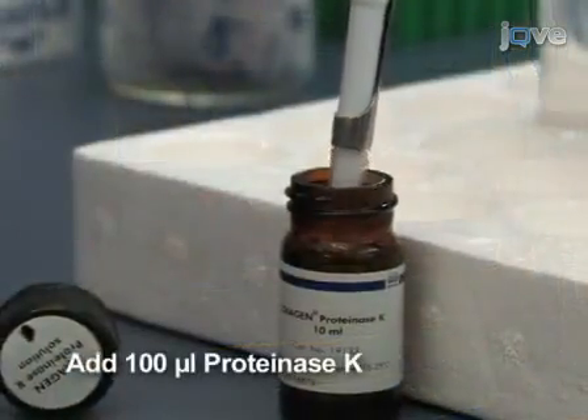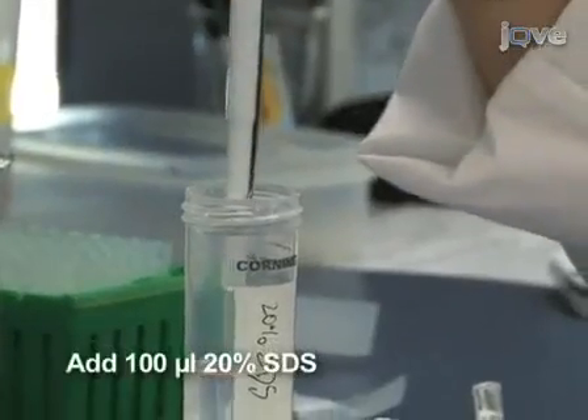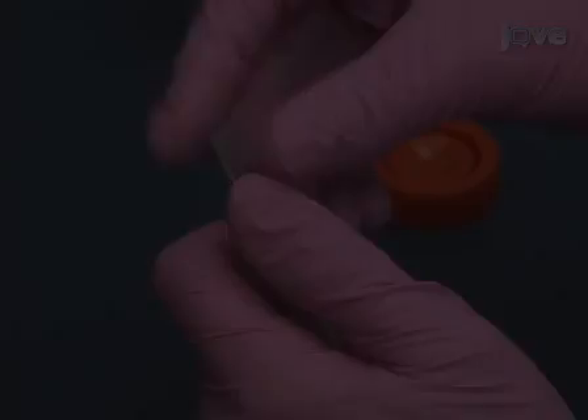For the next incubation, add 100 microliters proteinase K and 100 microliters 20% SDS to the filter. Re-seal the filter.